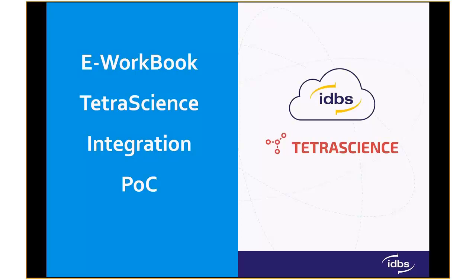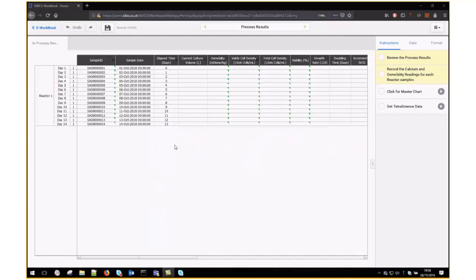This is a demonstration of a proof-of-concept integration between the bioreactor template from IDBS Bioprocess solution and the TetraScience data lake, which lives in Amazon S3. I'm working with the daily sampling view of this template, and for the sake of simplicity, I've disabled most of the other capabilities. If you'd like to know more about a bioreactor template, there are videos available which cover this.